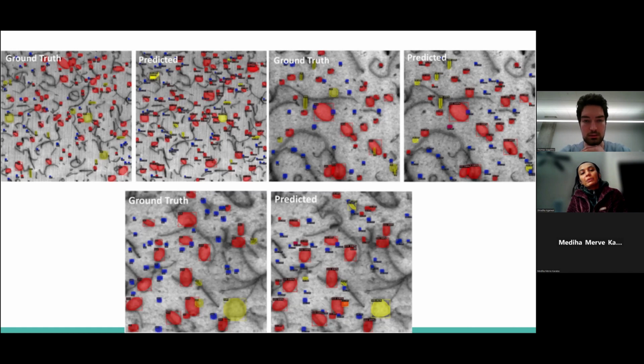Do you think with machine learning you would be able to separate those lines? It looks tricky, right? Maybe semantic. I imagine you might have some difficulty with the ones that are overlapping, but this has already been impressive in its ability to detect overlapping objects, but maybe not such thin, line-shaped ones. So I'd wonder if that would require a slight modification of the algorithm or something like that. I don't know.